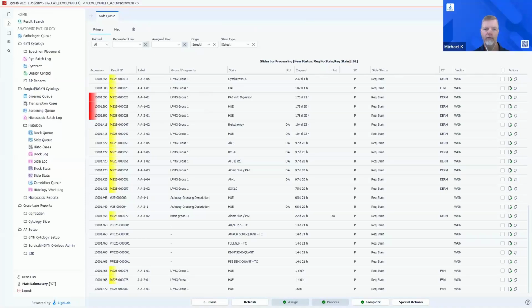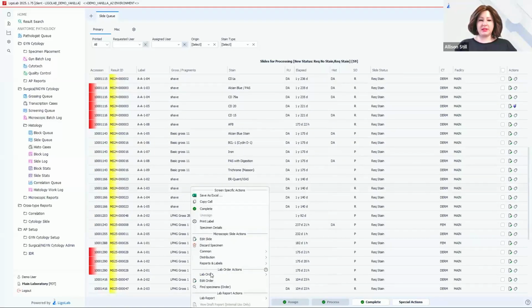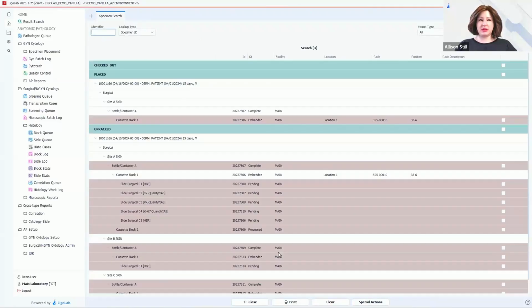Okay, and another one: for independent multi-facilities, how do you differentiate specimens with the same specimen ID? As an example, S1435 from different sites. Yeah, in our system, every specimen gets its own unique identifier. Here, I'll just go to a random case in this queue to demonstrate.